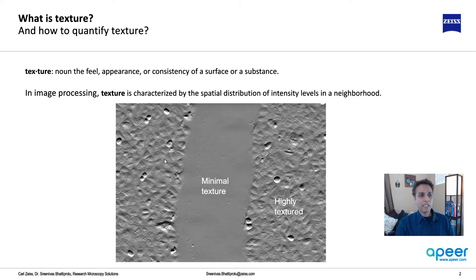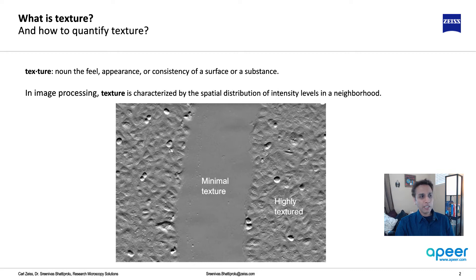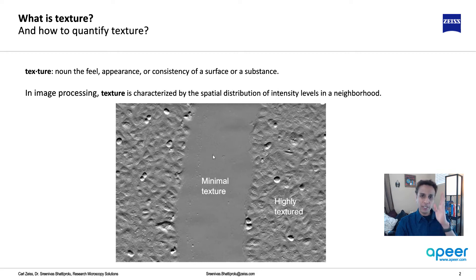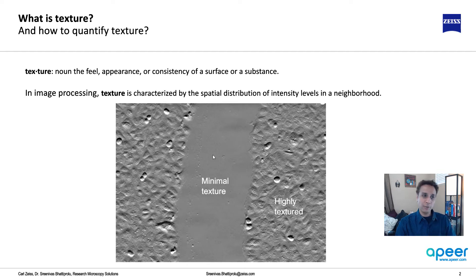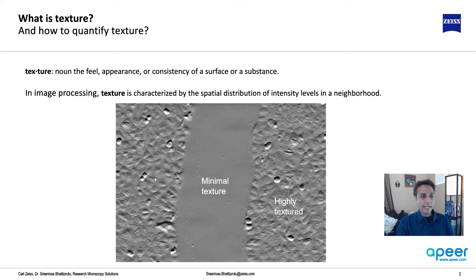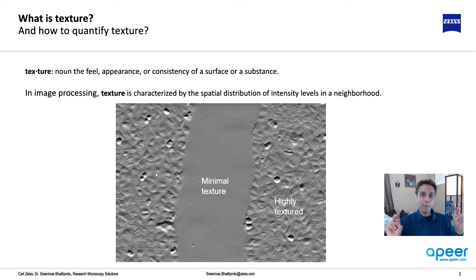Now, how can we segment this image? If you look at the histogram, the pixel values here and here are very similar. You cannot just set a threshold and separate these two.